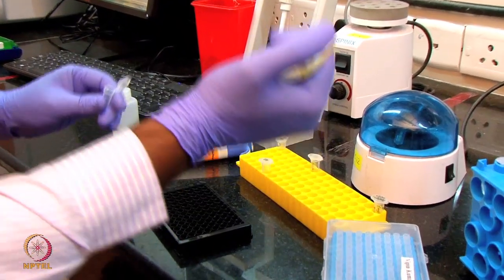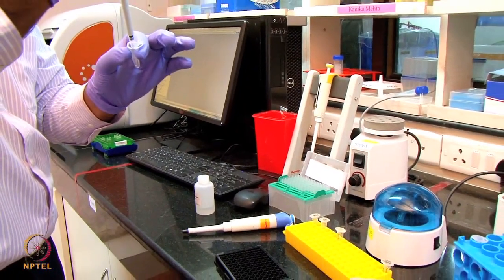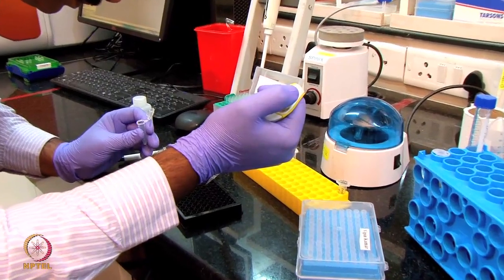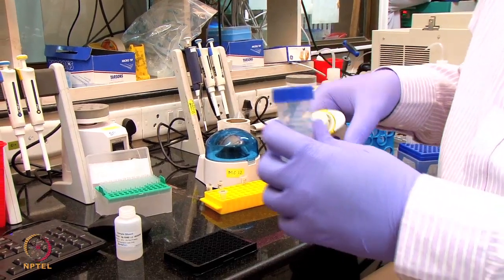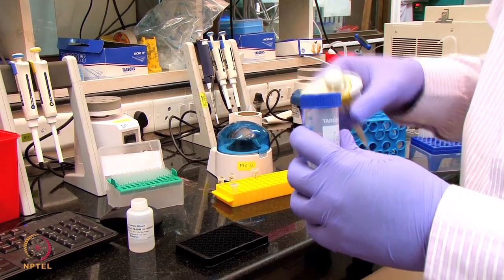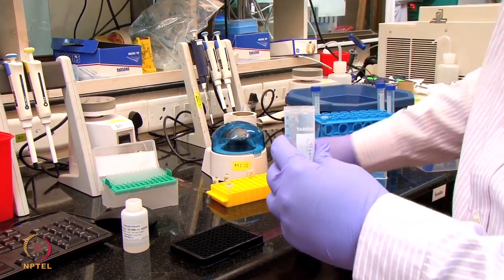Sample number 3 is at B4, and the sample number 3 at B5. So there are 3 unknown samples. I'm using the glycine buffer, a pH 2, 10 millimolar glycine buffer. This is used for the regeneration of the sensor.